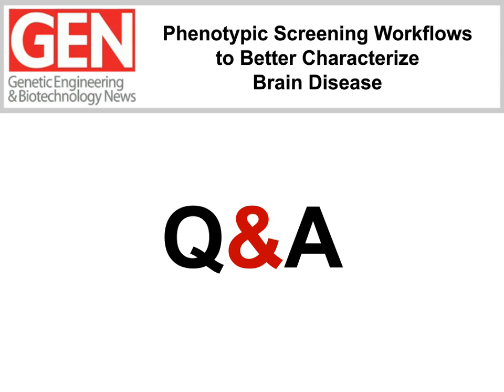Our next question is for Dan. Dan, how do other groups handle the analysis of signal in highly heterogeneous cell-based assays? Sure. Many people avoid these heterogeneous systems due to the low signal-to-noise ratio. Some groups have used fluorescent proteins that are driven by promoters with cell type specific expression, and one can then gate on that subpopulation. That's probably the best alternative solution to the sort of spatial analysis that I was describing.